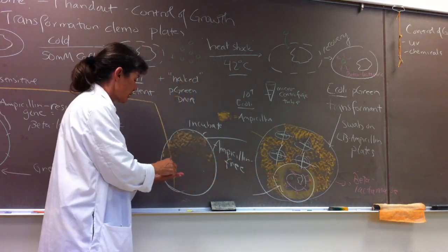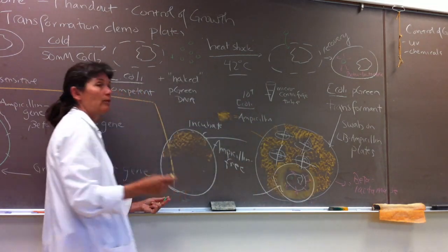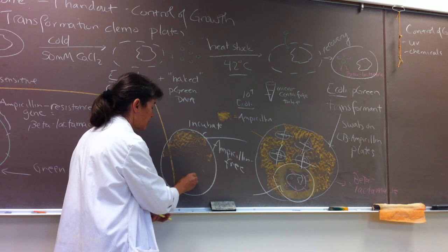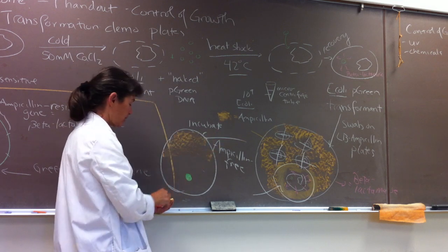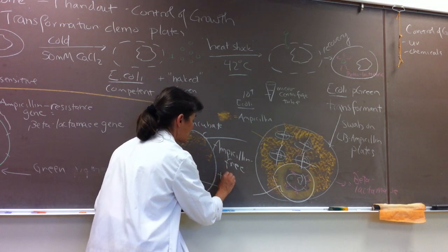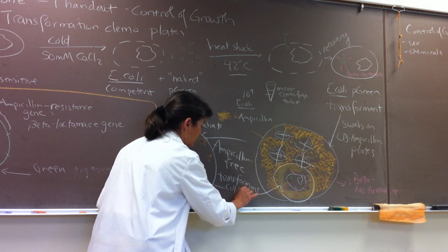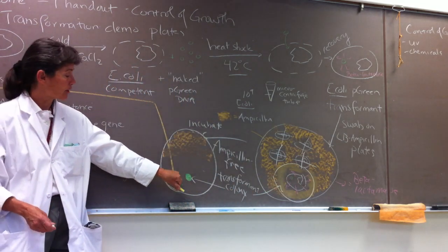Okay, so following incubation then, we will look for these beautiful green, yellowish colonies. They actually fluoresce under black light. They're really gorgeous. So now, you guys, again, we've changed our scale. This yellowish green colony is a transformant colony. It would represent maybe 10 to the 8 to 10 to the 9 of the descendants of that initial transformed E. coli.